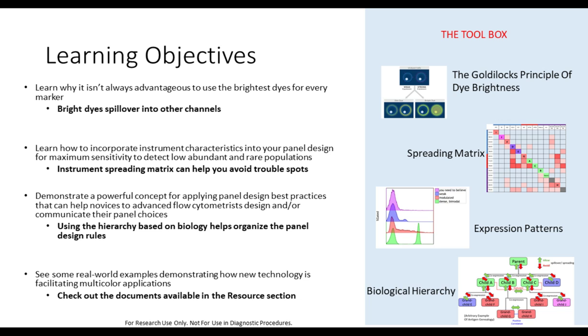Yeah, and then of course I would like to point at the resource section like Maria has already done. Here you find really examples that illustrate very well how you can follow these principles and how you can achieve powerful panel solutions. Right, and how the instrumentation can help to simplify the decisions you need to make, because sometimes you just have hard decisions to make.